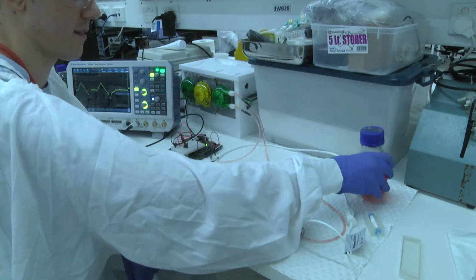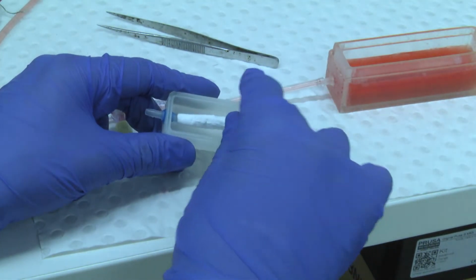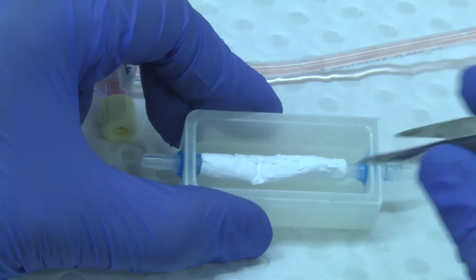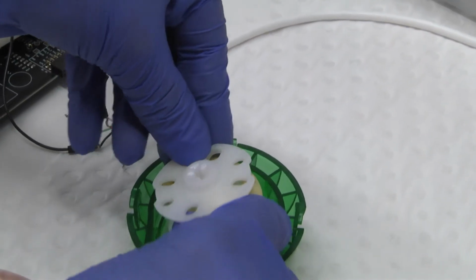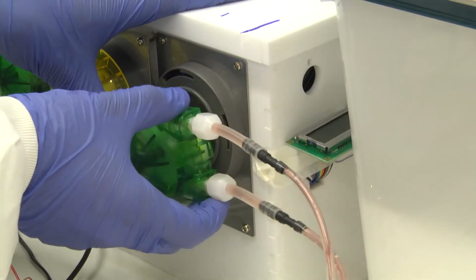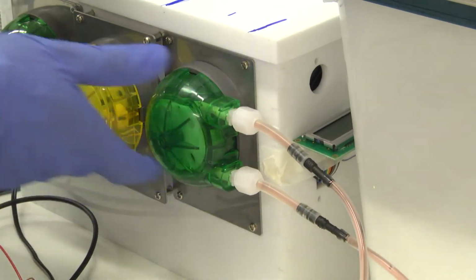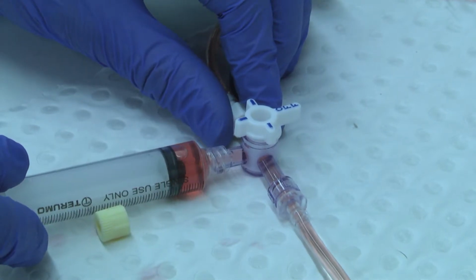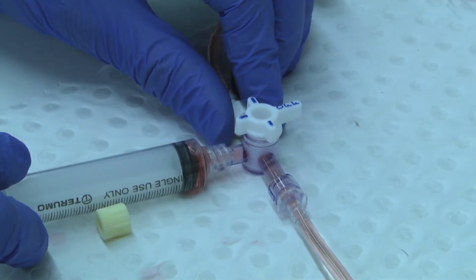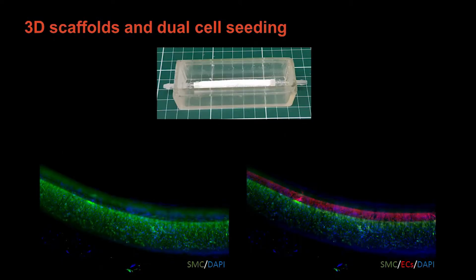And then we can seed cells in via the cell seeding port. So you've got your graft, you can attach it into your graft chamber, connect it to the pumps so you've got a closed system, and then after that you can do cell injections through the cell injection port. The cells will flow around the system and adhere to the grafts, and we have the opportunity to seed multiple cell types. As I touched on in the lecture, for vascular applications we're looking at both endothelial cells and smooth muscle cells.